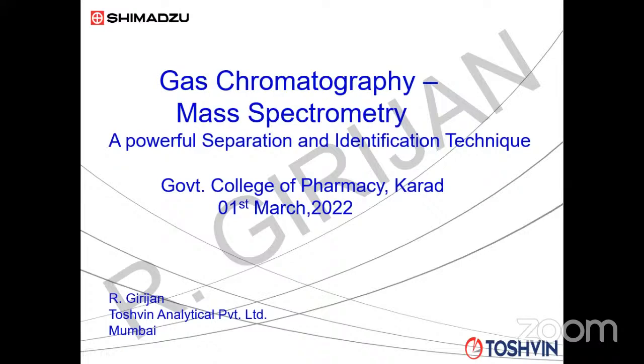Yes, sir, visible. Okay. So today I'm going to talk about a very interesting topic, gas chromatography connected to a mass spectrometer. It's a hyphenated system. All of us know there are so many different hyphenated systems available today. We talk about GCMS, LCMS, ICP-MS, TGMS. There are so many different hyphenated systems available, which are very powerful separation coupled with identification techniques.